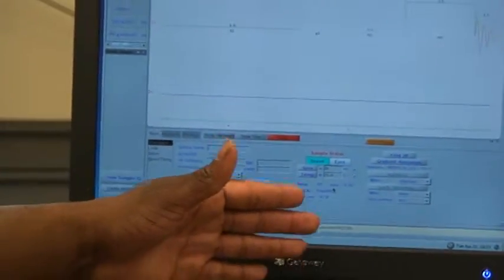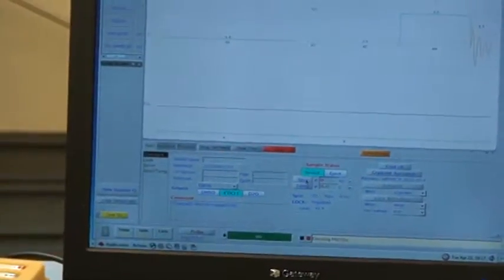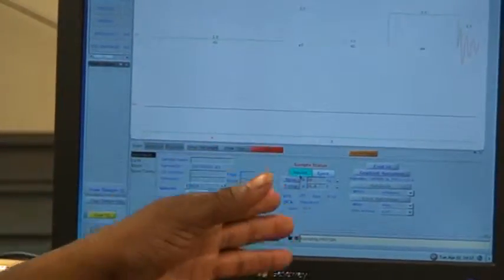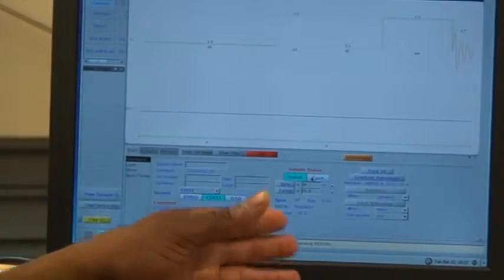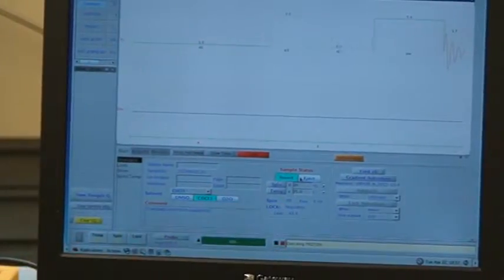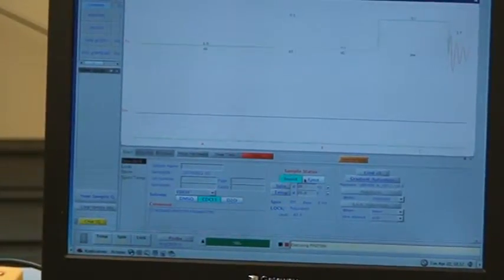In the start position, we also have the sample status. We can insert the sample and also eject it. When it's ejected, that's when it's floating on that bed of air.